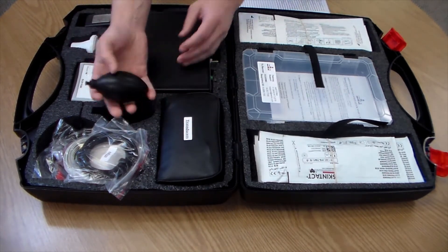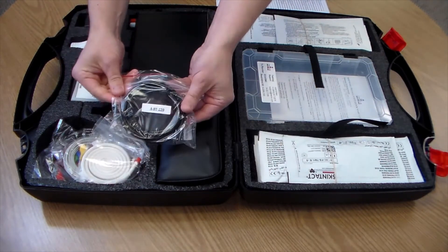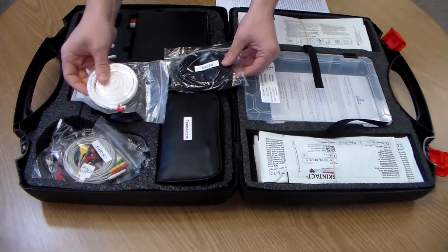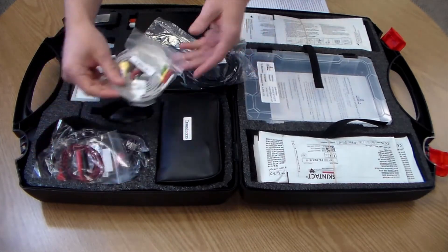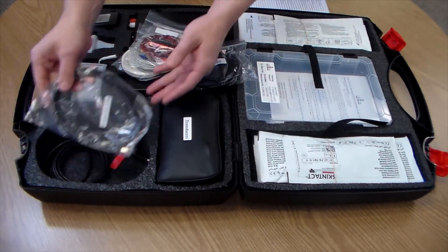The black bulb is your force transducer or hand dynamometer. Tubing for the force transducer and spirometer are located here. This is also where you will find the recording leads, the stimulation leads, and the USB cord to connect to your computer.